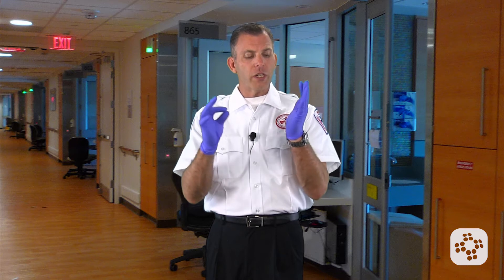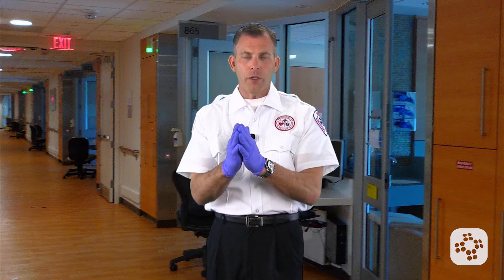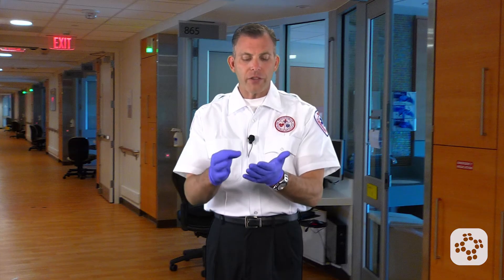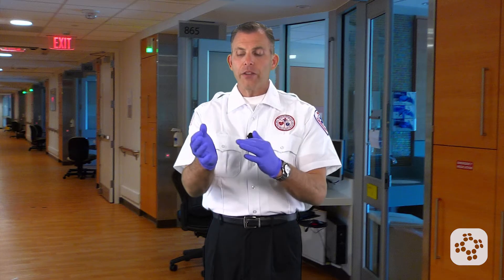But when they're contaminated, now comes the most important part of this skill: removal of contaminated or potentially contaminated gloves. We're going to follow the glove-on-glove, skin-on-skin rule. In this process, it's important that we keep the contaminated materials on the glove side and the non-contaminated to our skin side.